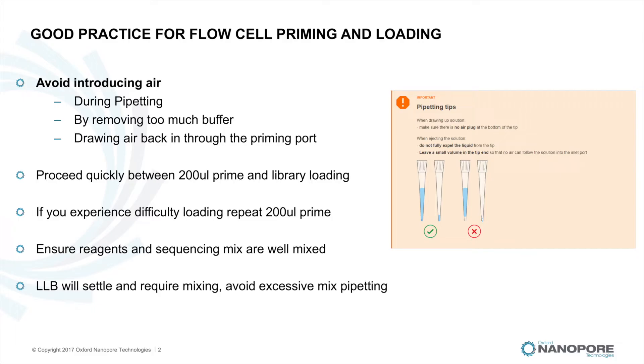Before flow cell priming and loading, be sure to familiarise yourself with good practice pipetting to prevent introducing air into the sensor array, which could have a detrimental effect on the membranes and subsequently the active pore count. Avoid introducing air as this will permanently damage the integrity of the pore membranes. Proceed quickly between your 200 microlitre priming and library loading, and ensure your reagents and sample are well mixed, as loading library beads (LLB) will settle very quickly.